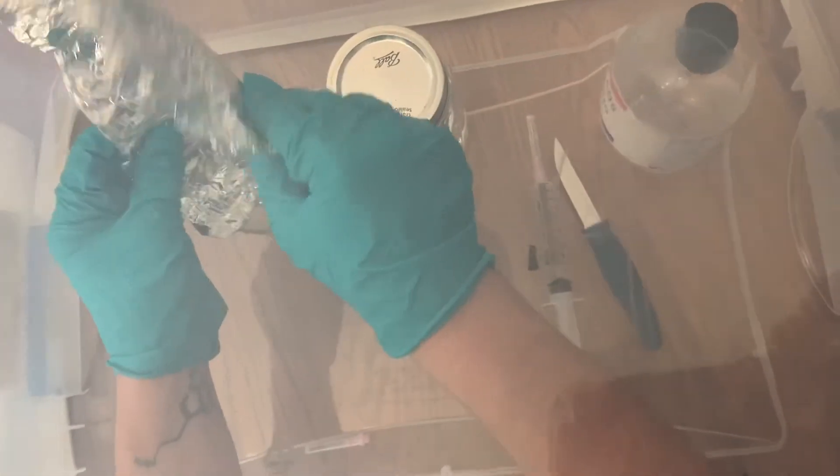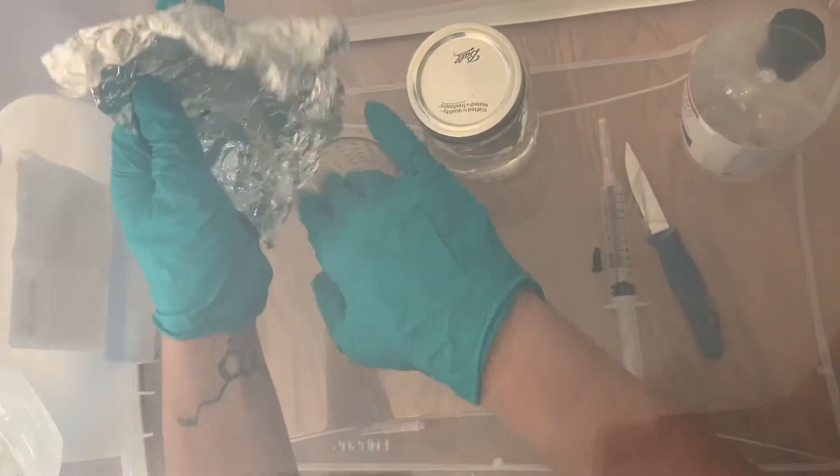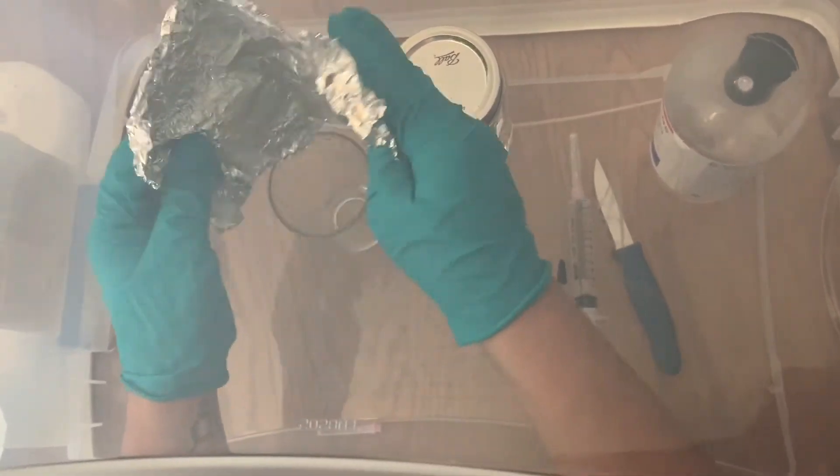In this example I'm going to be making a syringe from a wild elm oyster mushroom, and the spore print was white — that's why you can't really see anything on the tin foil.